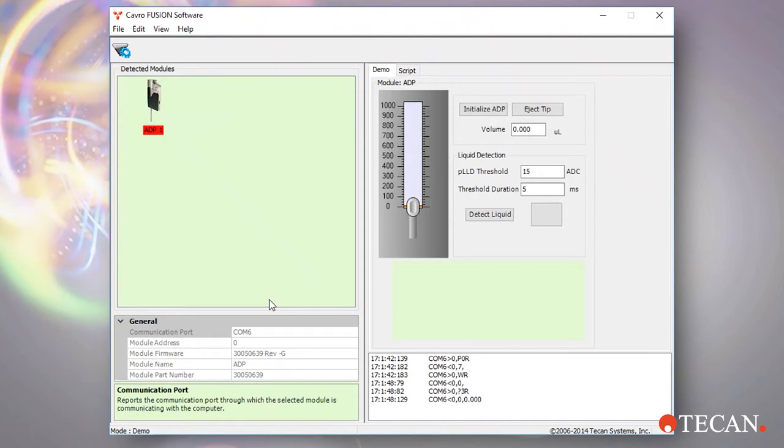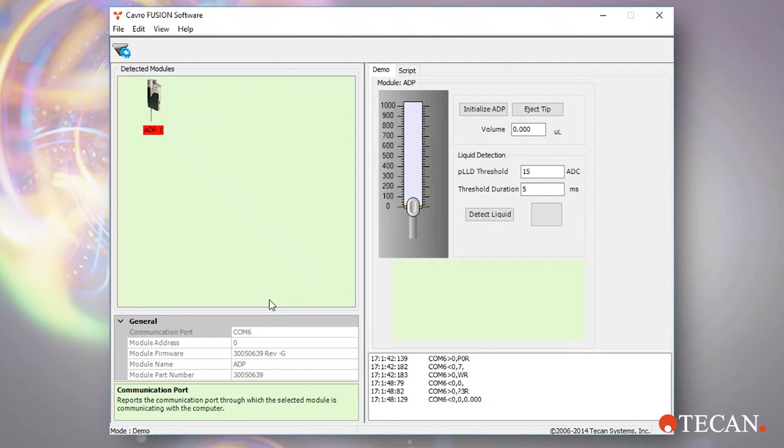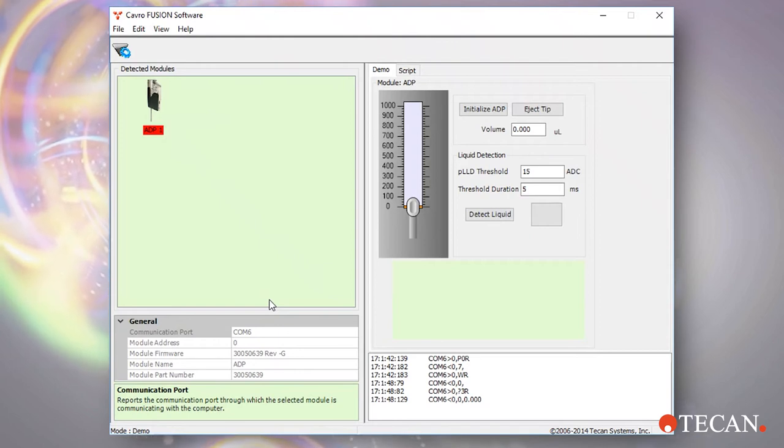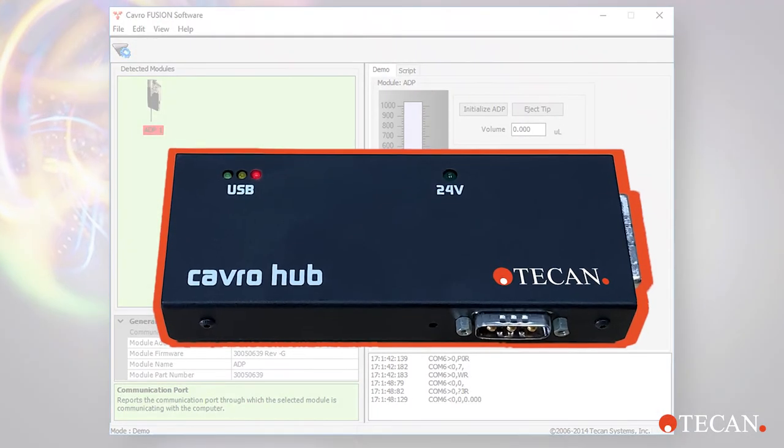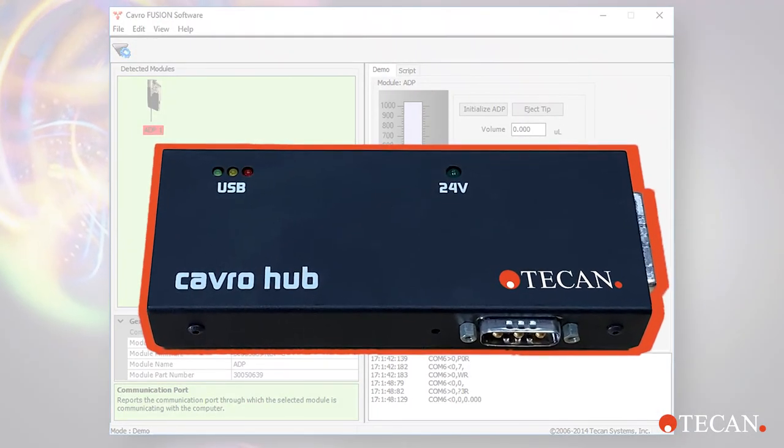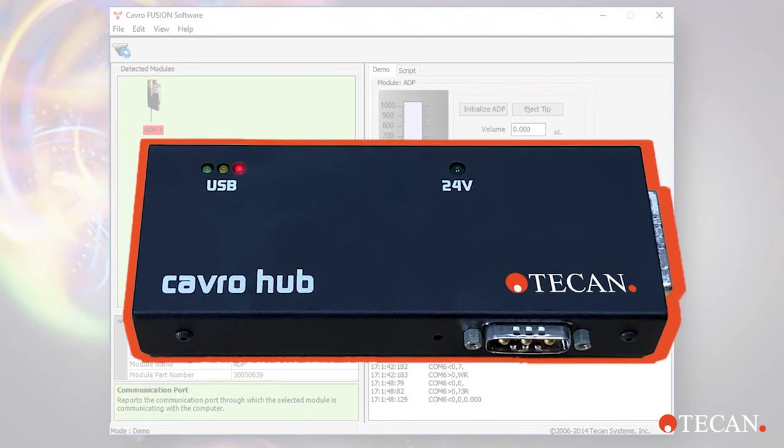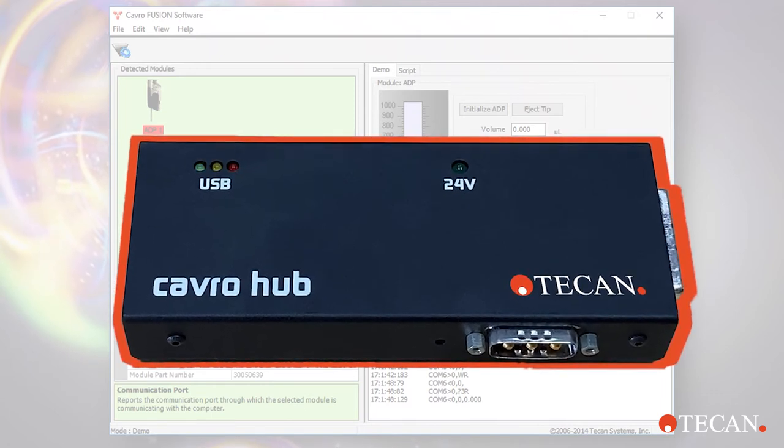If the ADP was not automatically discovered, rescan after verifying that the CAVRO hub driver is correctly communicating with the laptop. Power and communication lights on the CAVRO hub indicate the correct cabling. The ADP dip switches are set correctly and the ADP LED is illuminated.